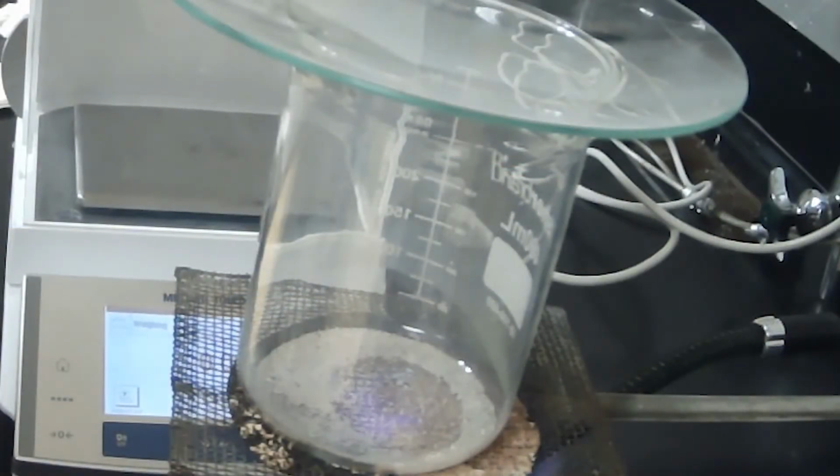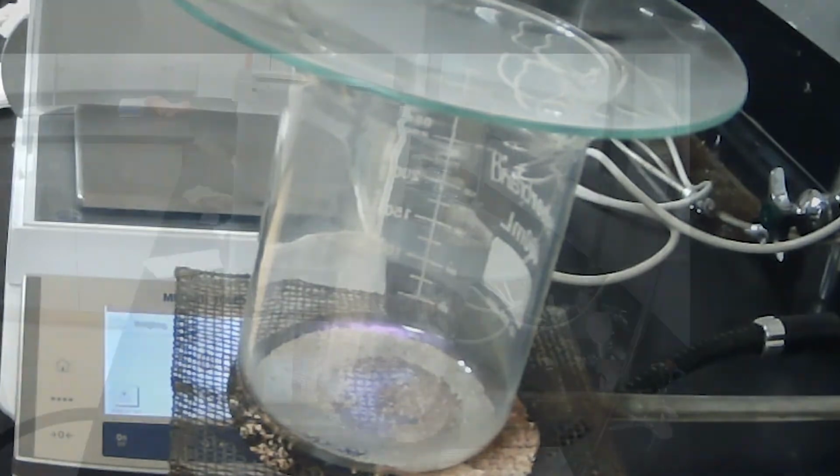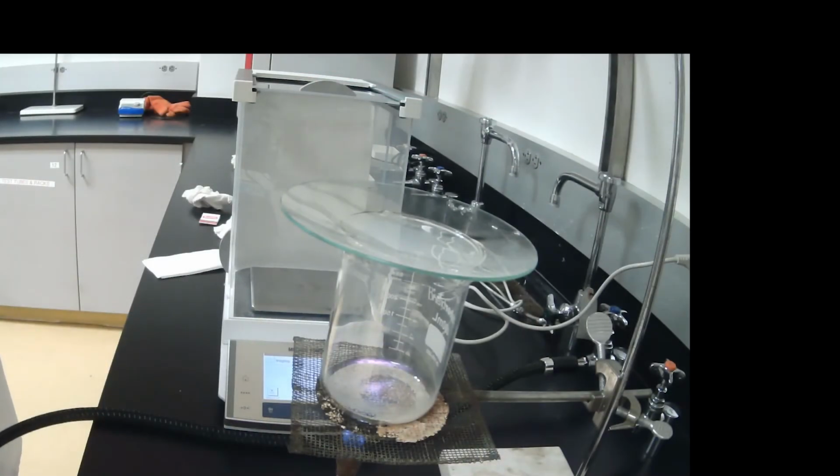If I look closely, I'm beginning to see a faint haze going around the beaker. So there was a trace amount of ammonium chloride there. Not very much, as we did remove most of it the first time. And so I'm going to try to drive that haze up the side. Just like the first time, we need an inch of clear glass with no haziness.